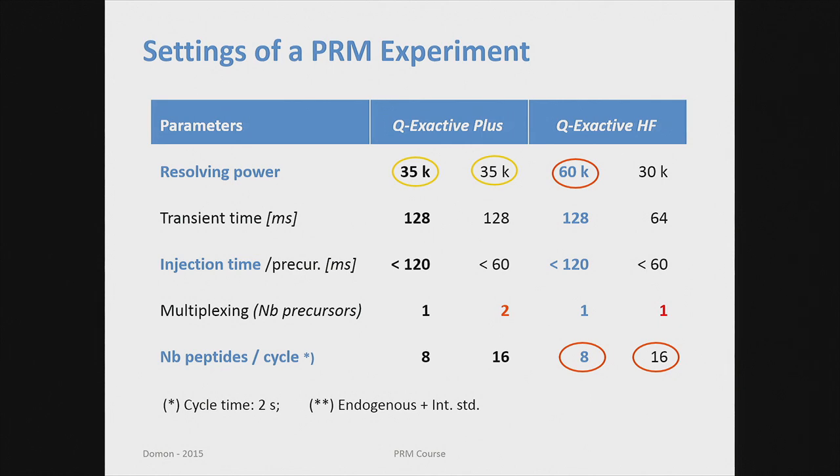And if we multiplex only one time, basically we see here that if you assume for chromatography, which is classic nanospray, we have a 20-second peak width. We want to quantify with 10 points across the peak. That means 8 to 10 points across the peak. We can back calculate, 2 seconds divided by 120 gives you 8 peptides in one 2-second cycle, right? So that's how many you can measure.